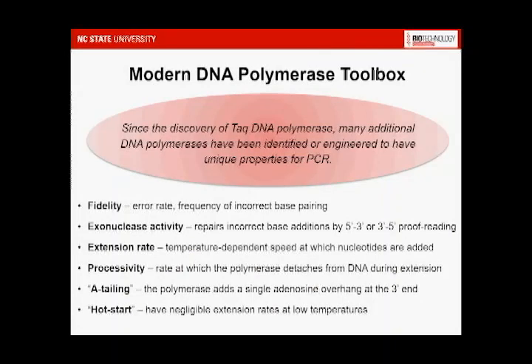When developing a PCR protocol for your own research, in the future you'll need to select a DNA polymerase that's suitable for your application. When it comes time to select this DNA polymerase, please consult product literature to find your best polymerase, and keep in mind that there are many out there that can have these different characteristics.